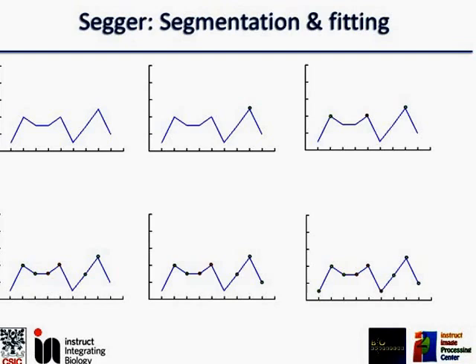Okay, so I decrease again the density threshold. Now I have these three points. This point is a neighbor of this voxel here, so as they are neighbors, I assign it the same segment as this other point. The same for this one, and so on, until all the points are classified. What is the problem with that? That this method is producing a lot of regions.